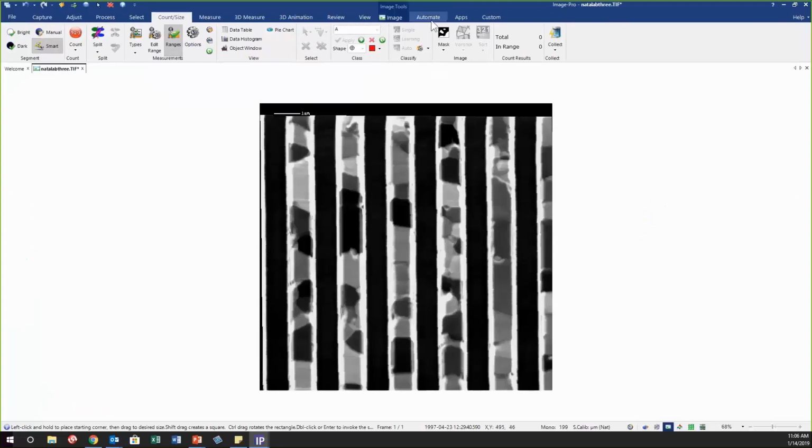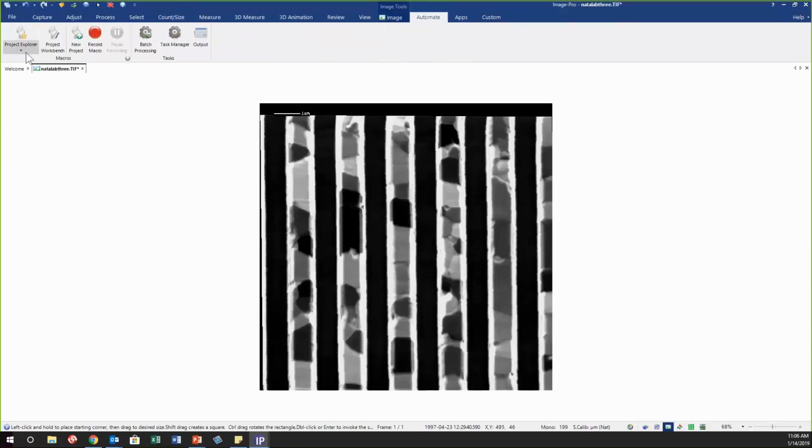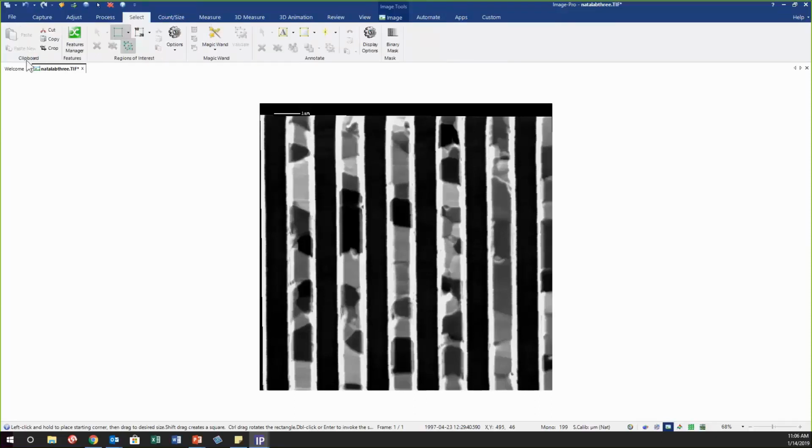So in this case, I want to run my macro that's going to prompt me to draw a region of interest. Please draw the ROIs. Again, you can put directions on what the person should do. I'm already in the correct tool, and so now, again, whether I was using Feature Manager, I can now draw my ROIs. I may want to make a little adjustment, or I may just say in the center there. Now I'm going to redo that one just a little bit. I know I'm going to pick up some of that edge that I don't want. There we go.